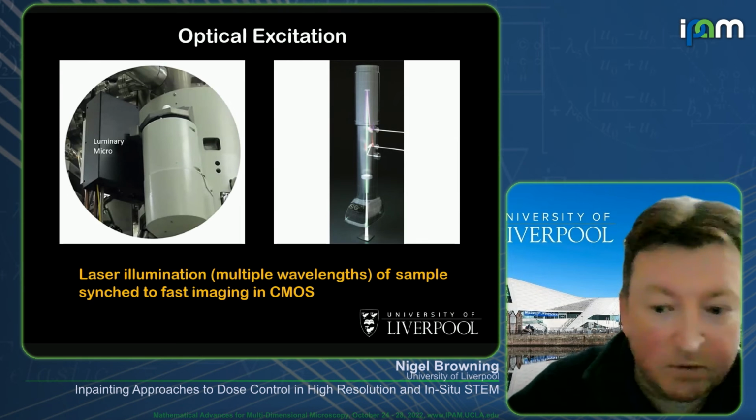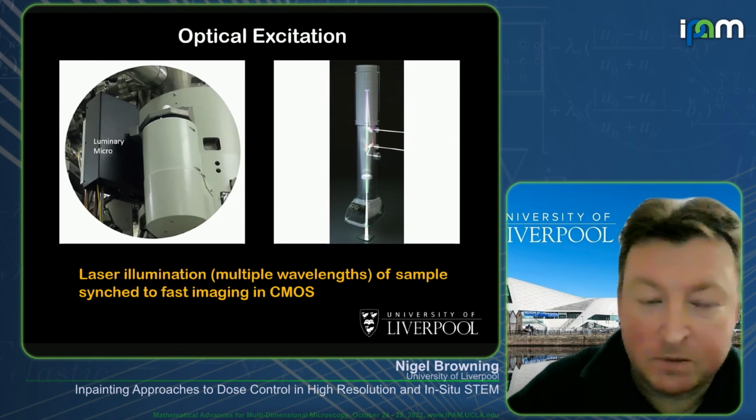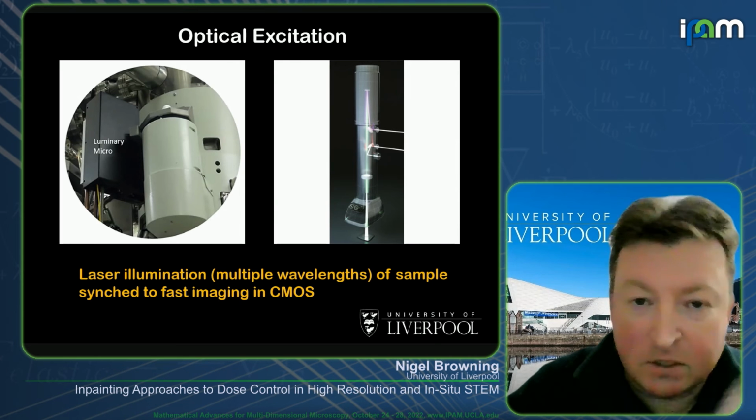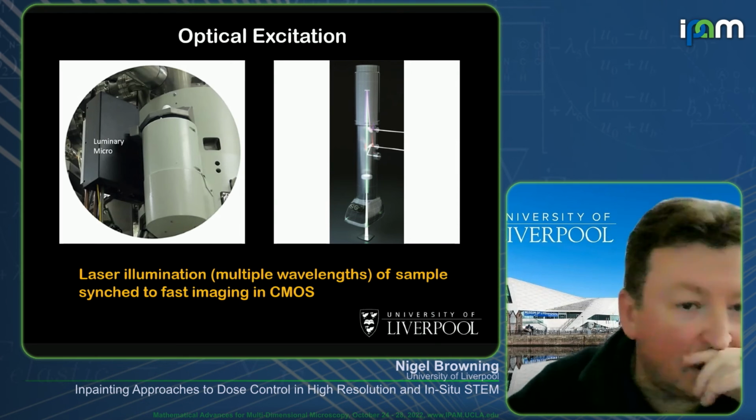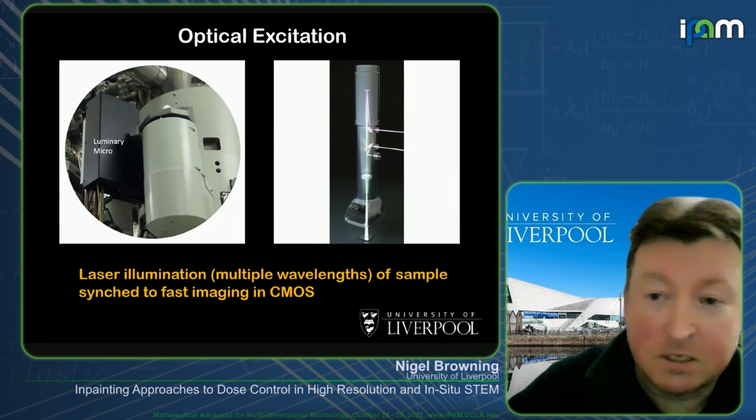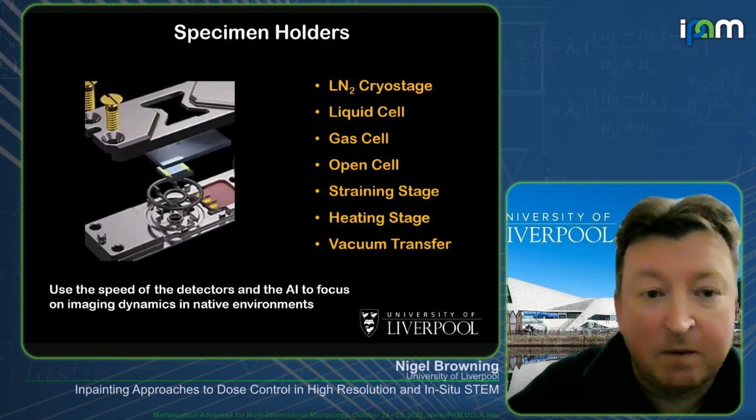With the Lumin system from IDS, we should be able to do optical excitations to look at excited states for the things that will be happening. There's no real transient effect that we're looking at here because we don't have the temporal resolution on this, but we can look at illuminated samples to look at changes that will be happening with that.